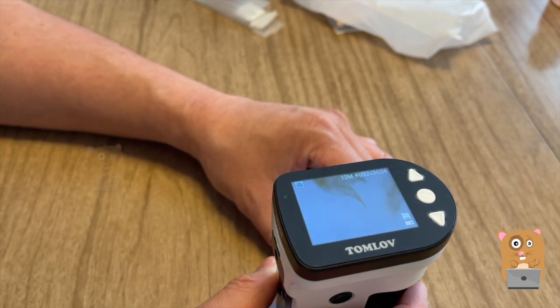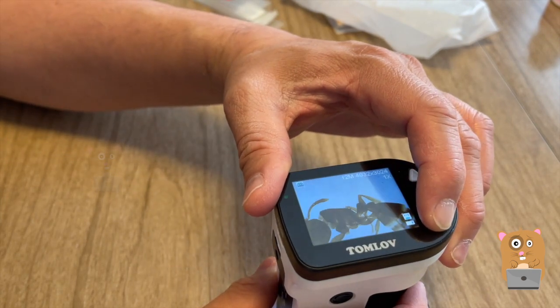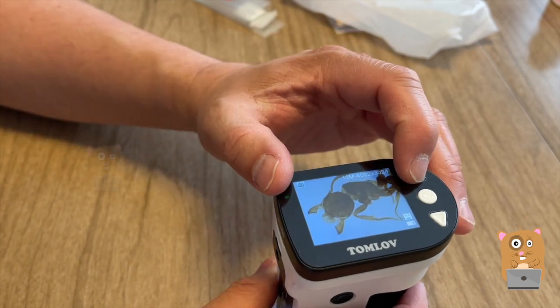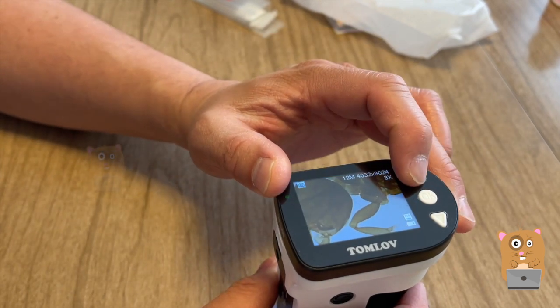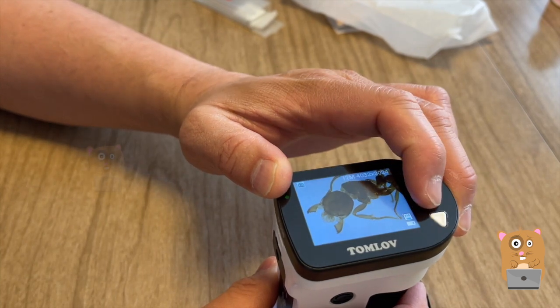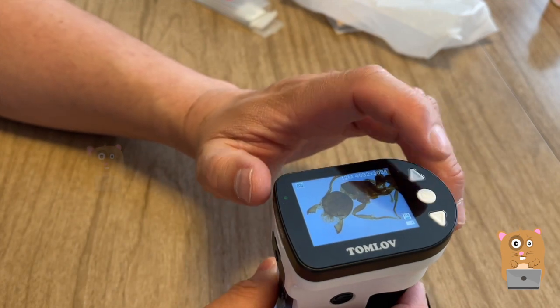The ant stinger. Let me zoom out. Currently this is 1x, 2x, 3x, 4x. Pressing the OK button, I just took a snapshot.